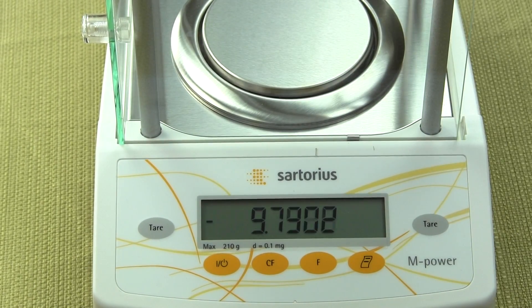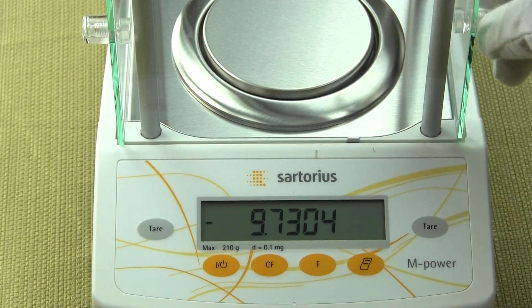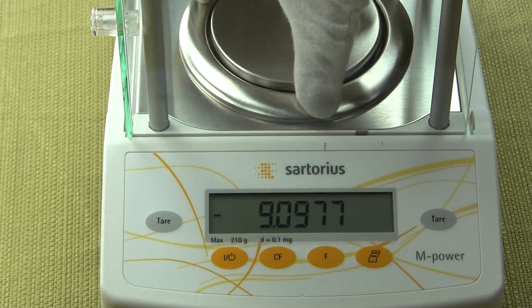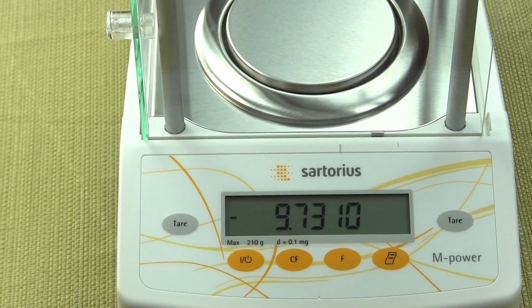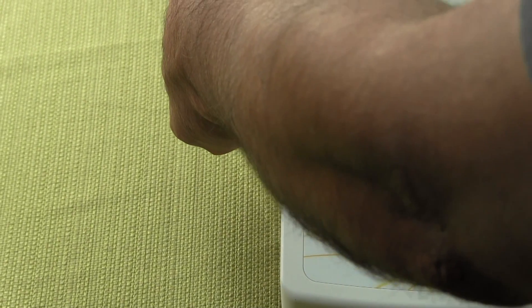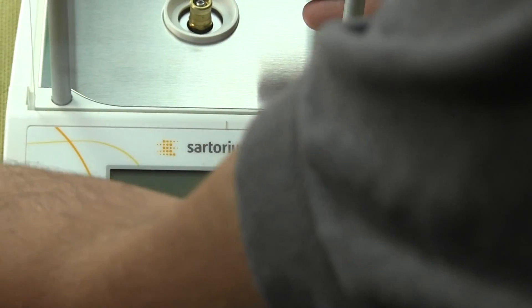Let's go over a few more of the attributes of this analytical balance. The balance has a weigh pan. This weigh pan measures three and a half inches in diameter.